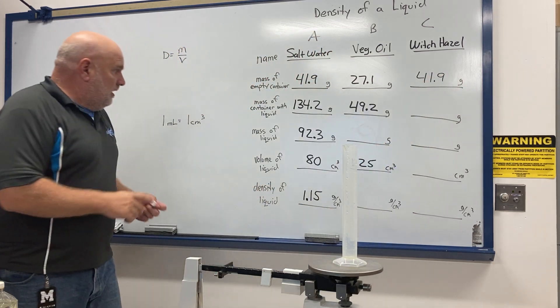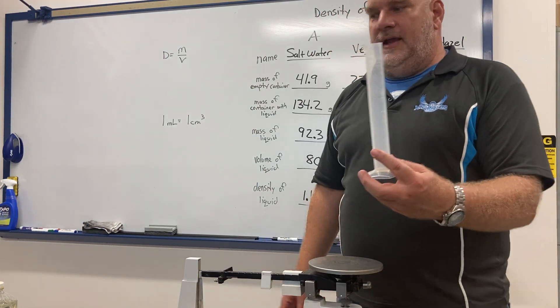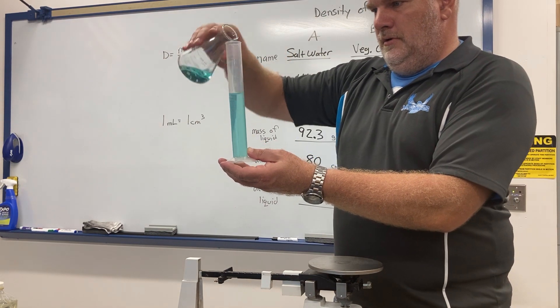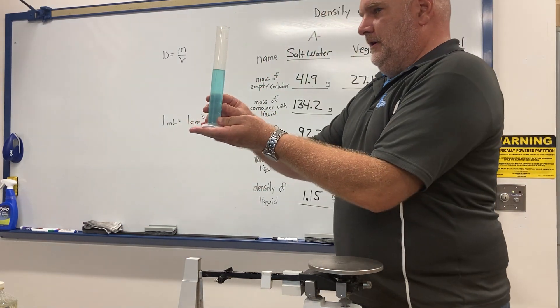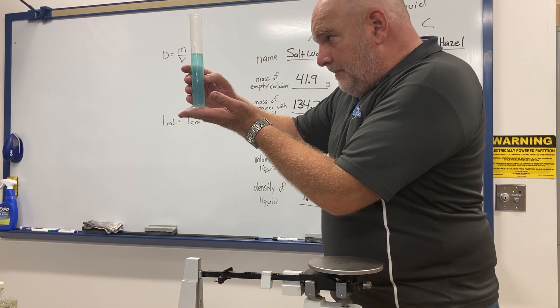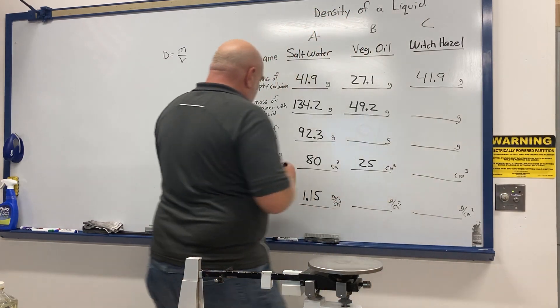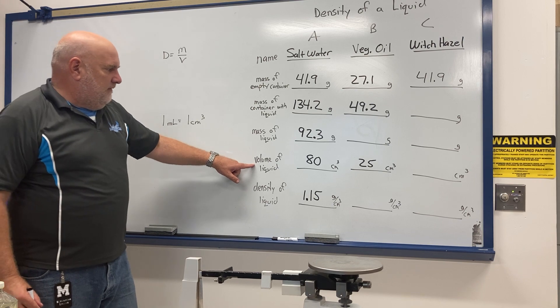Now I pour some of the witch hazel into the graduated cylinder. Looking at the graduated cylinder, there's about 72 milliliters of witch hazel. So 72 milliliters goes down as the volume of the liquid.